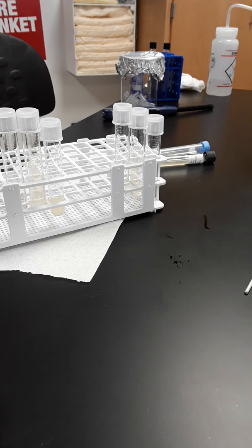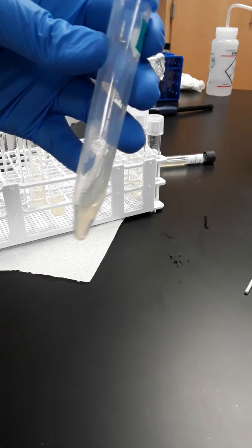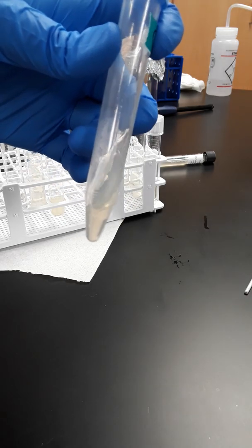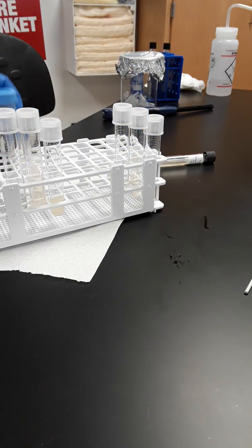In this video, I'm going to explain the second part of Lab 1 for microbiology, and in this we're doing a series of sterile transfers. So we are going to be taking a culture from a slant. As you can see, this is solid, and it's at an angle, the agar's at an angle, so that's what makes it a slant. I say agar funny.